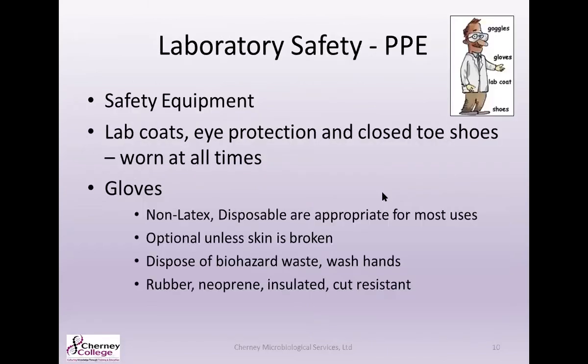Going over PPE for laboratory safety. Working in a lab requires the right PPE for the task at hand. So make sure you've got lab coats, eye protection, a full apron if needed, and then obviously you're gonna want some gloves.